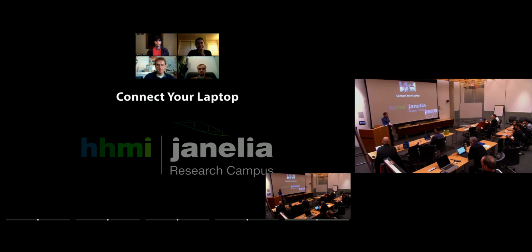In my previous incarnation, we were doing a research project, and I'll just tell you a little bit about it rather than show you slides, but it was a scanning polarization microscope. We were using Micromanager to control it, but the idea is that you would scan wavelengths back and forth, and that translated to scanning polarization states. And we were trying to do this as fast as possible, taking 100 milliseconds to take maybe 10 or 11 images, and have wavelength switching built into that.